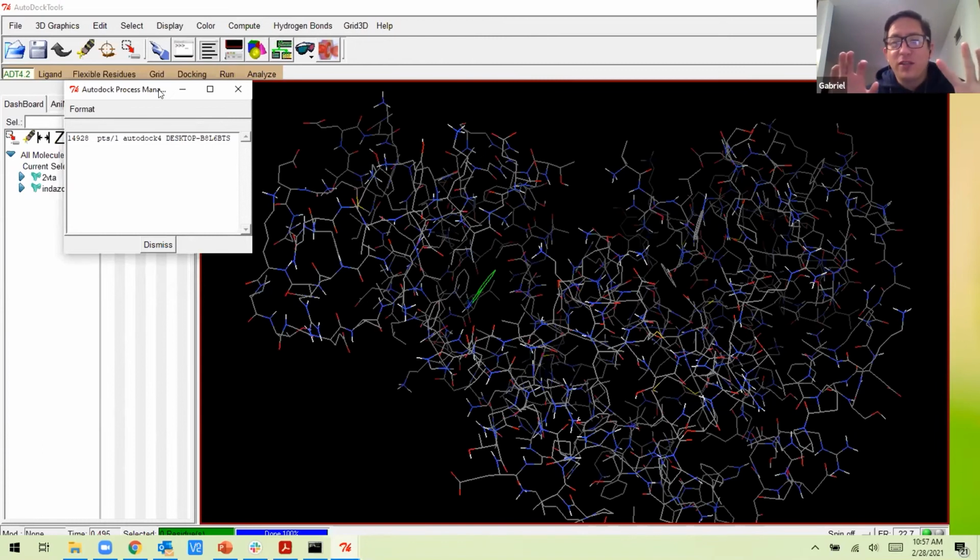If you want to do it for the challenge, you want to select your protein. So now you can go to the PDB, download your protein. If I want to work with another molecule, you can do the same thing. Natalie has a question. See, Natalie.